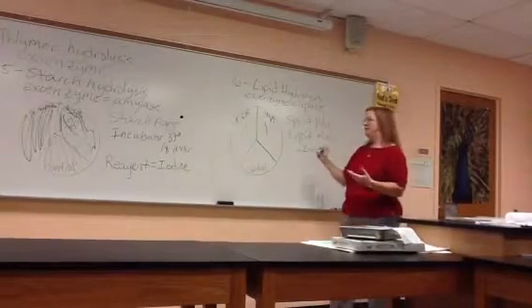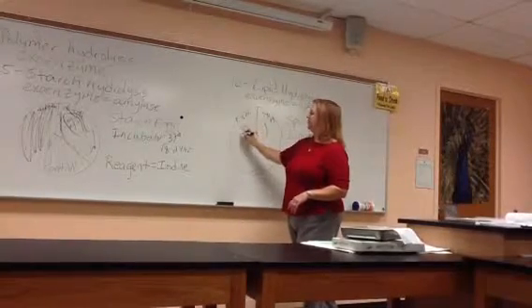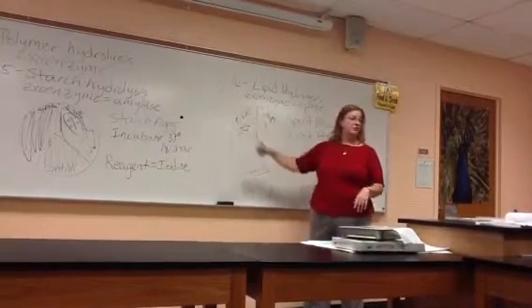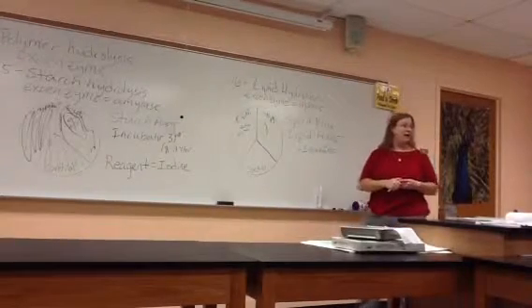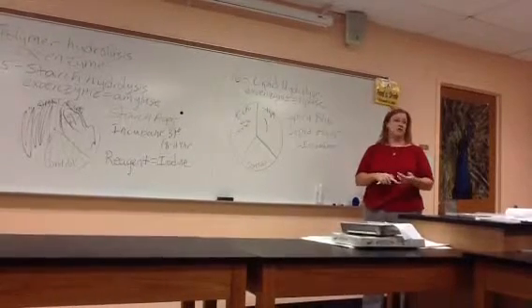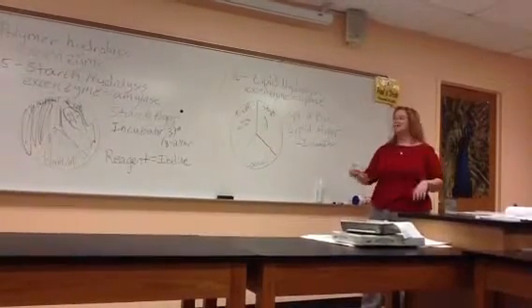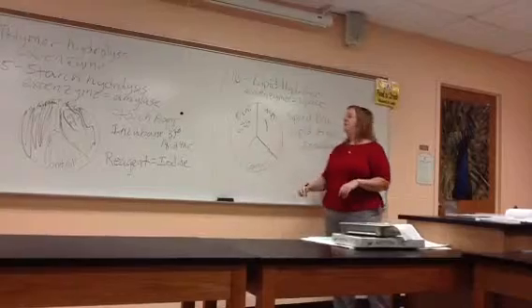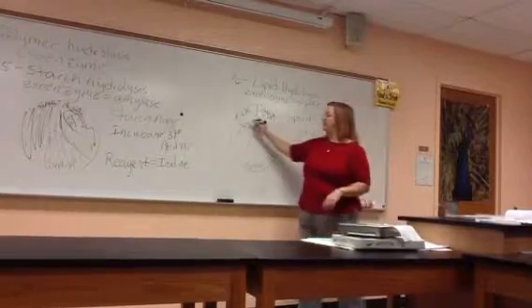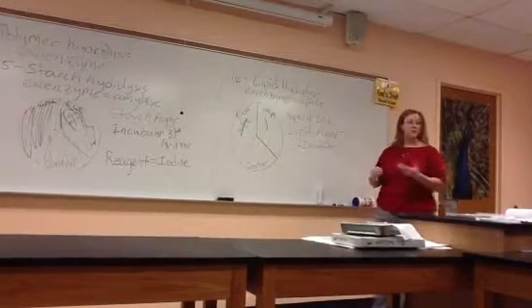Okay, so what's going to happen, let's pretend it's this bacteria. In the incubator, if this is the one that makes lipase, it's going to secrete it to the outside. Right? Lipase is going to move by diffusion, break down all of the fat around those E. coli, and then the bacteria are going to take in the pieces. This is dietary fat, so the pieces are glycerol and fatty acids, right, from lecture. So those glycerol and fatty acid pieces are going to be absorbed by the bacteria. And remember, those pieces were stained blue. So as they take those pieces in, the bacteria themselves are going to become darker and darker and darker blue as they've absorbed the blue stained fat.